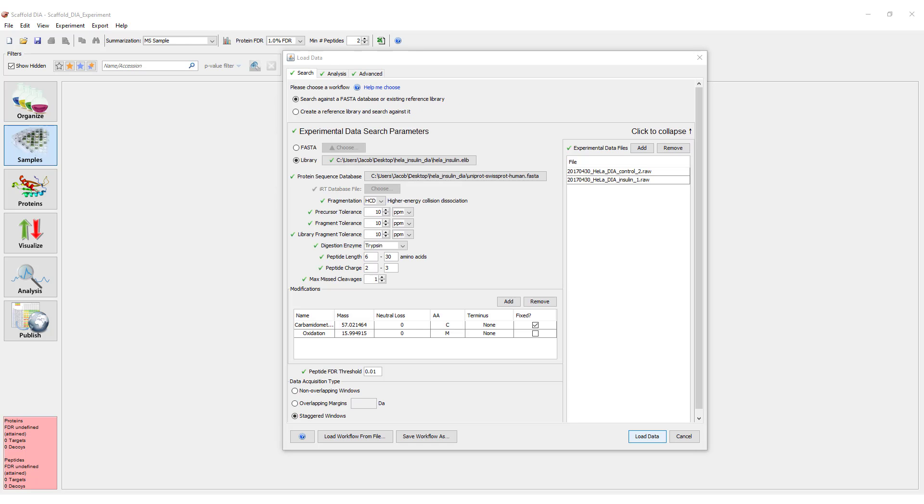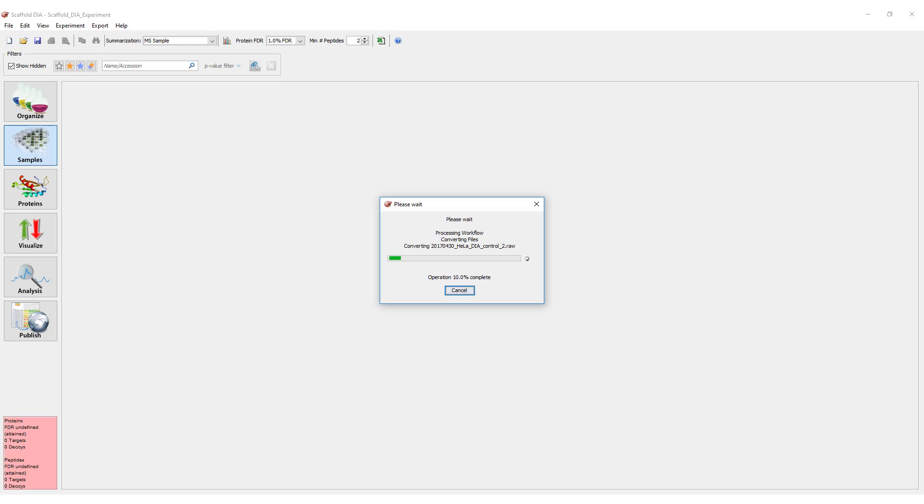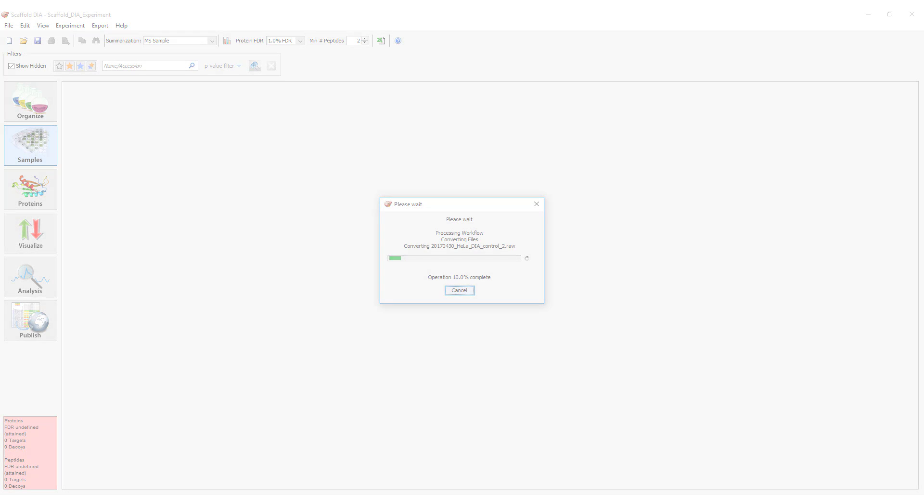Once all parameters have been defined, there should be no yellow triangles in the workflow dialog. You can now click load data to start processing data.